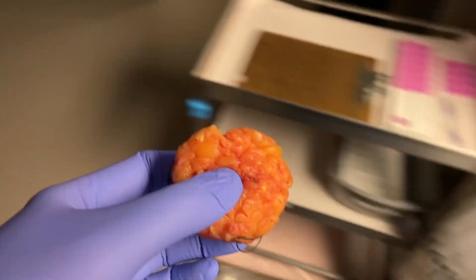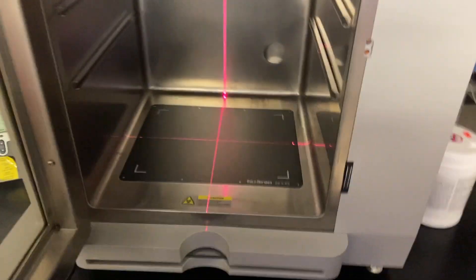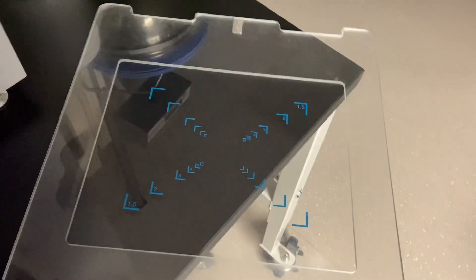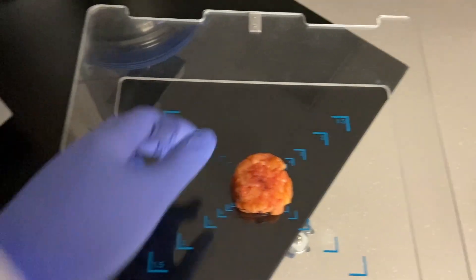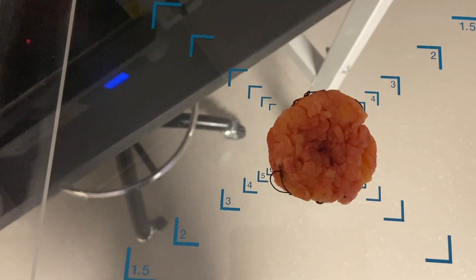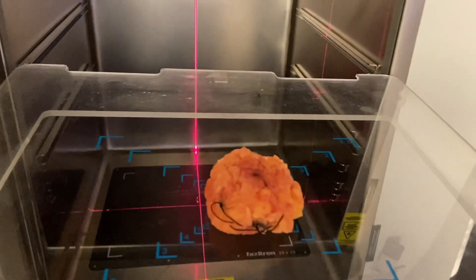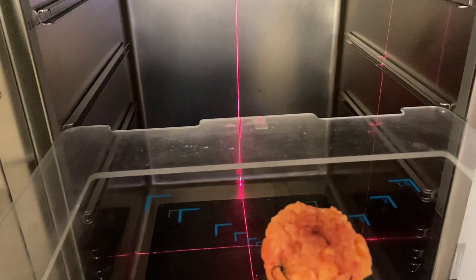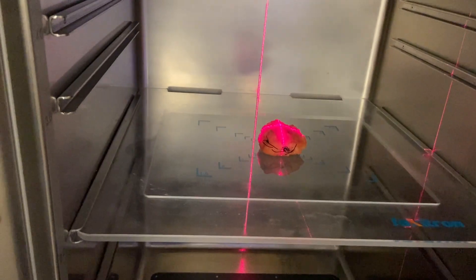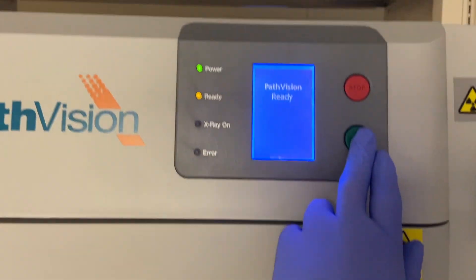Take your partial mastectomy over to the Faxatron, open the door, pull out the grid, and place the specimen in the middle of the grid. We could put it on shelf 3, but let's do shelf 2 because it works better. This device self-calibrates the magnification based on the size of the specimen. You can see the laser crosshair grid going right through it. Close the door and hit go.